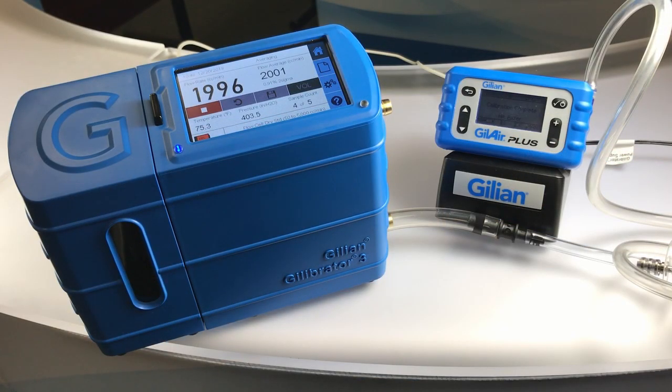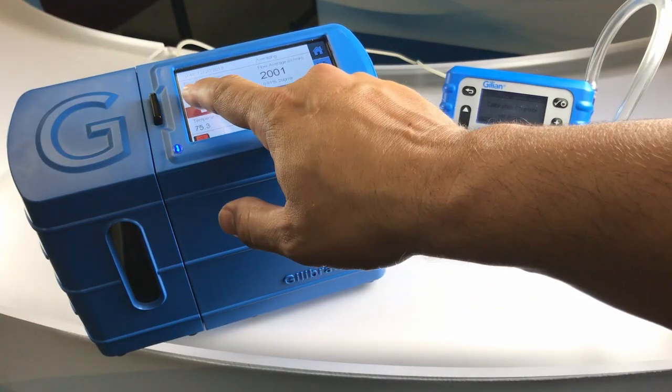As the measurements are sent to the pump, it will display the latest flow measurement on the screen. The Gillibrator 3 screen will show the measurement once the puck is moving up, so it may look delayed from the display of the pump. Allow the system to run until the calibration process is done and press the stop button on the Gillibrator 3.